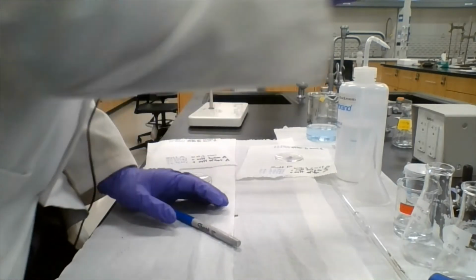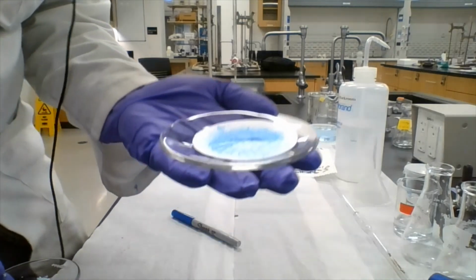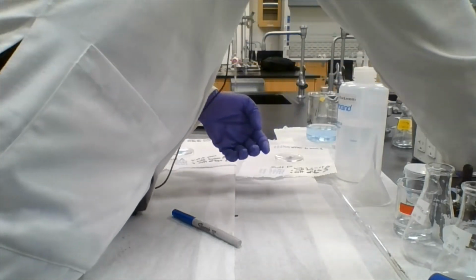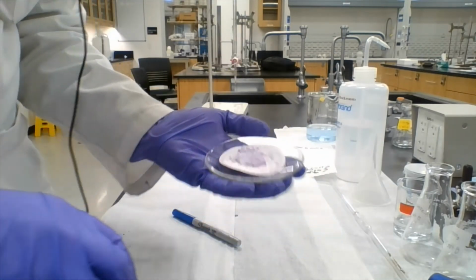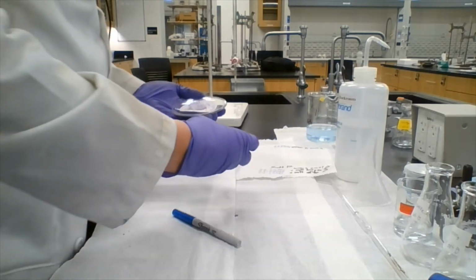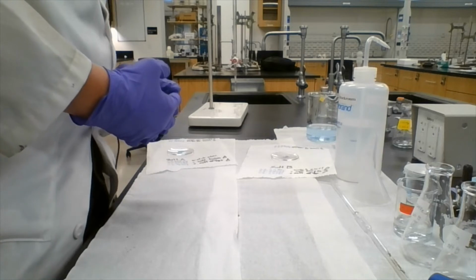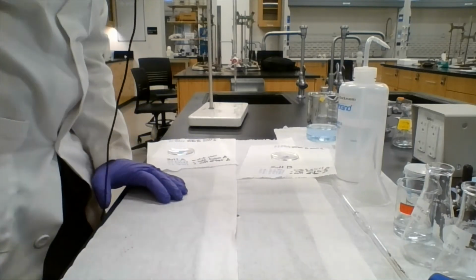Oh, and just comparing the colors of the two. This is salt A before, salt A after. Salt B before, and salt B after. So we can definitely tell that something has changed. All right.